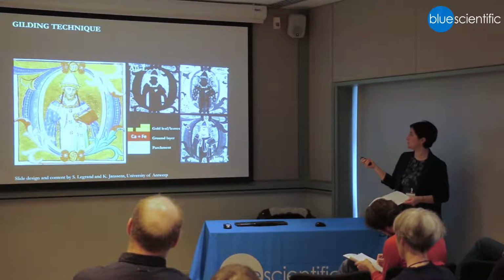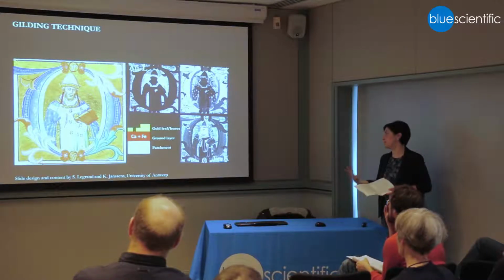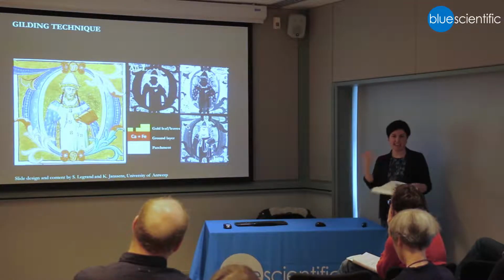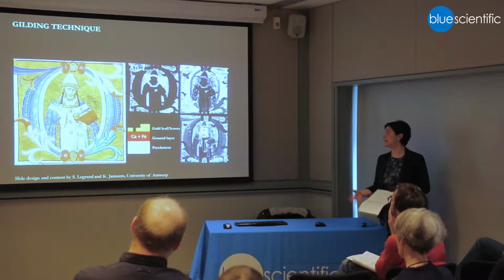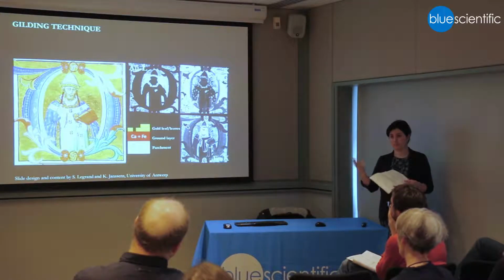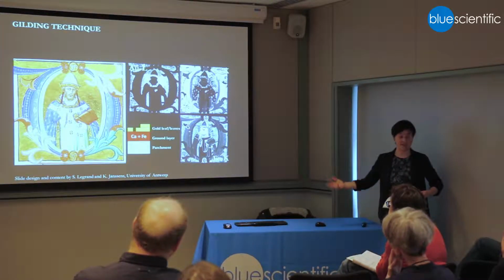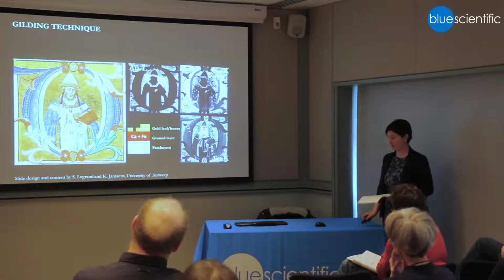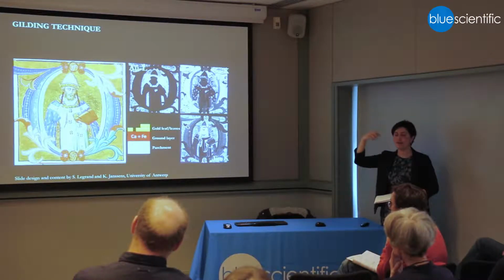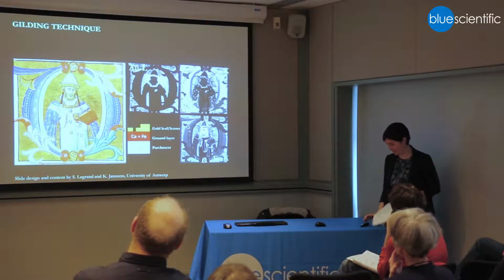And then we found there was calcium and there was iron in areas of gilding. So it's the kind of ground layer for gold that you expect. The iron is probably due to the presence of a red clay type material. And the calcium, when we get this far, the only thing we know is a calcium containing material. We can suppose it's gypsum, because that's what historically has been used. But we can't be absolutely sure. There's some little losses in the gilding, but they were too small for us to analyze by reflected spectroscopy, which would tell us if gypsum were present. They were just too small, we couldn't access them.